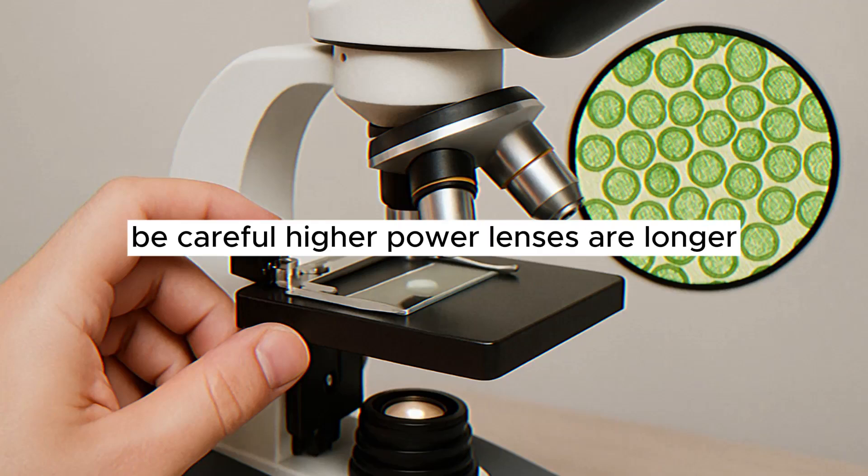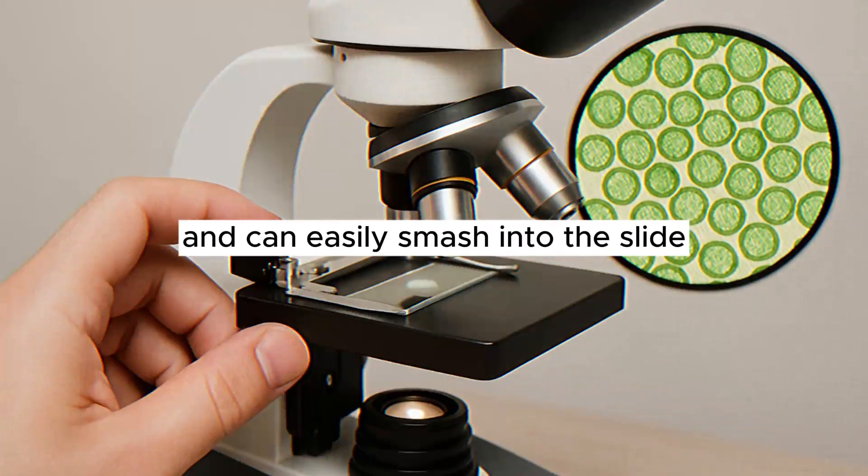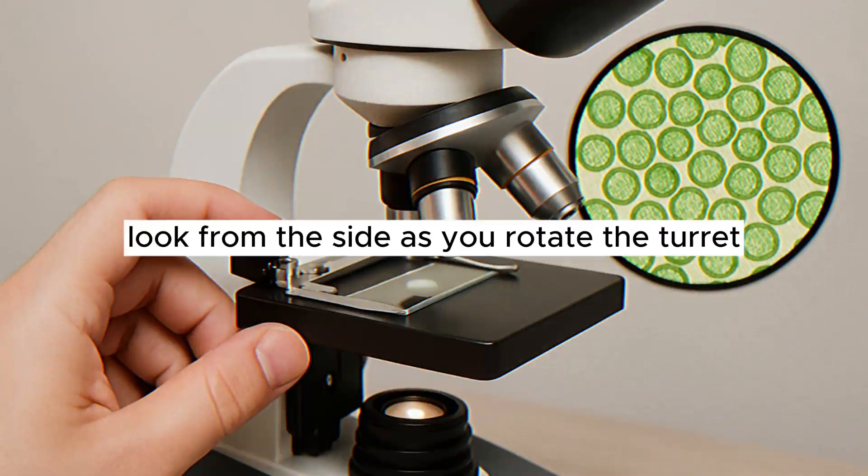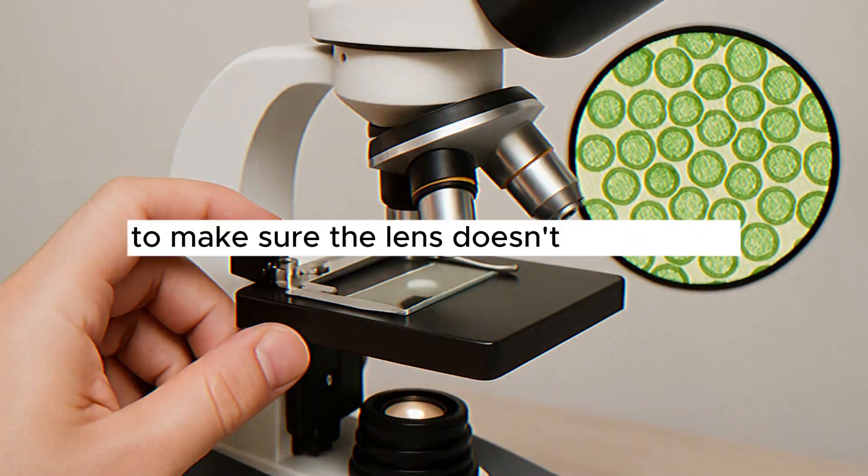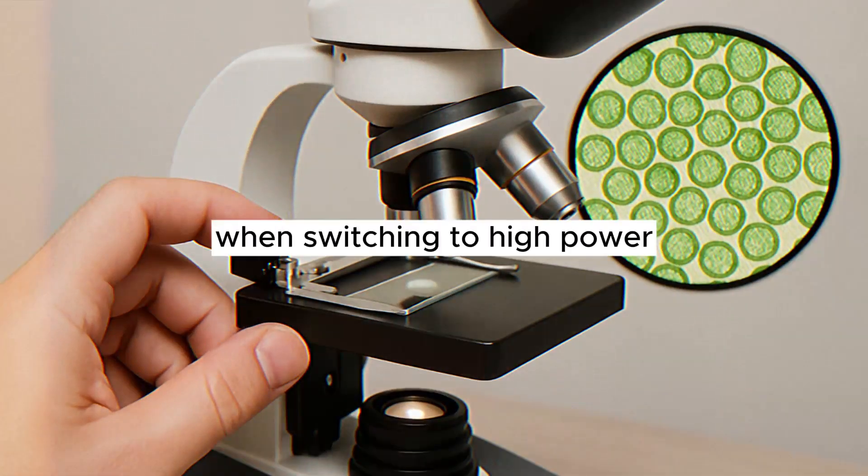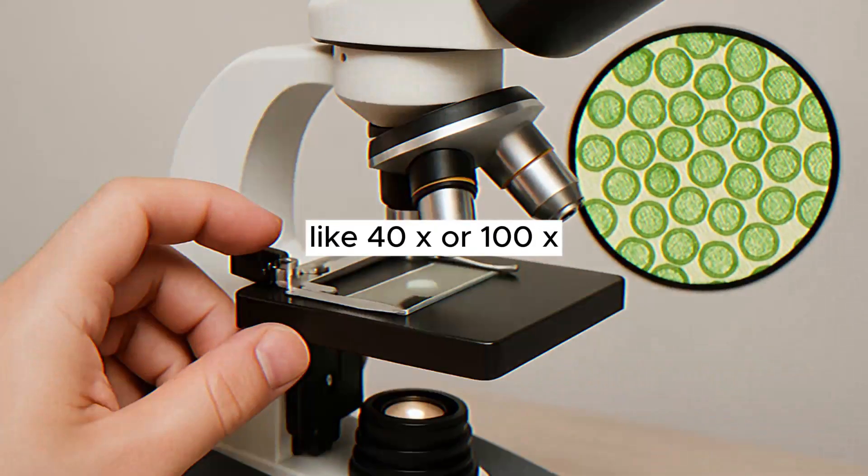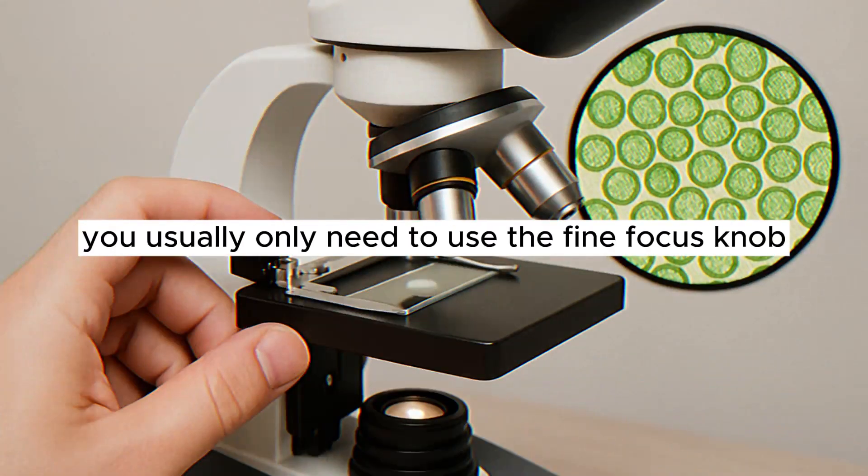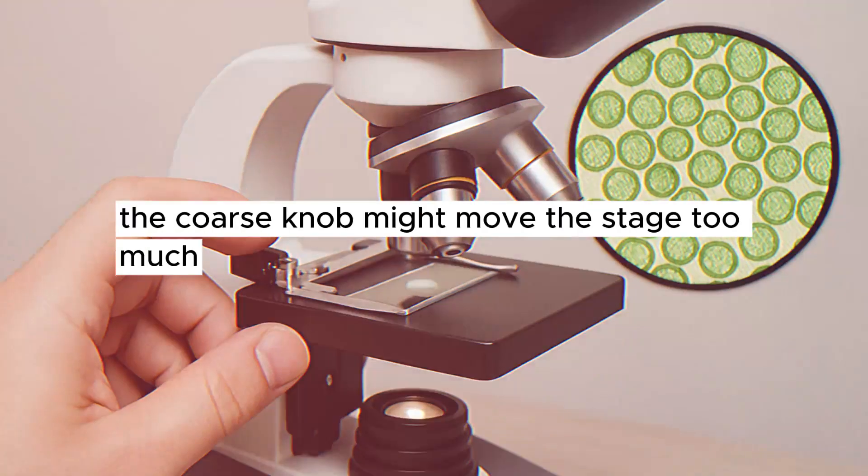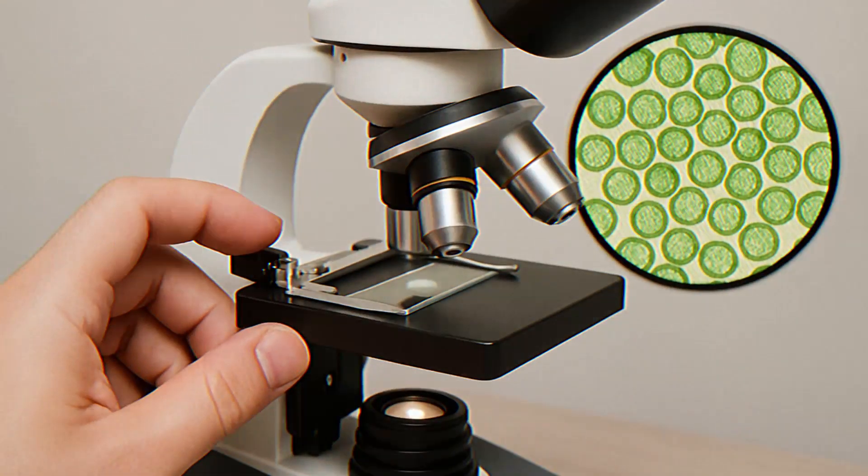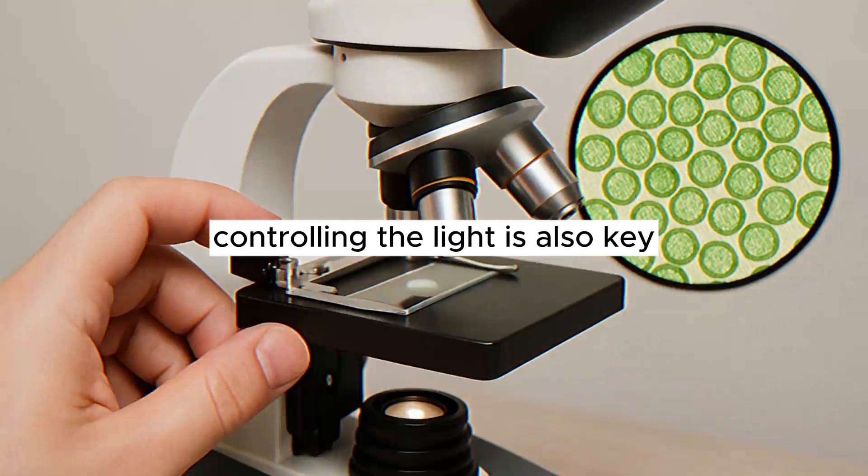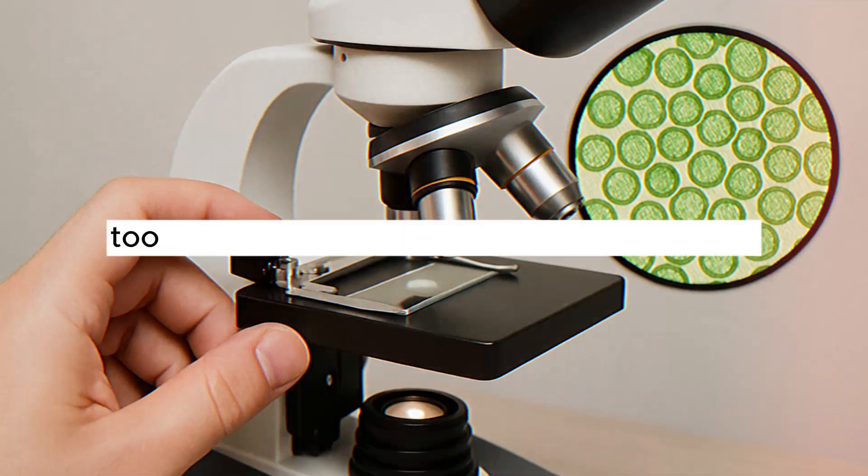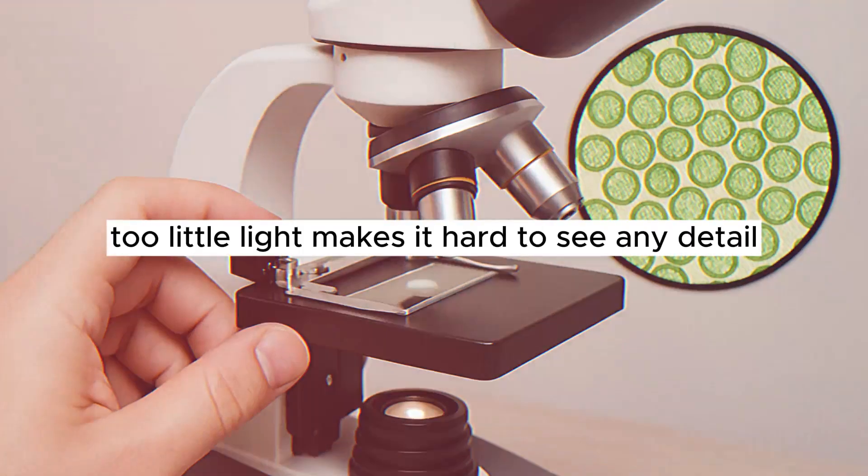Be careful! Higher power lenses are longer and can easily smash into the slide if you're not paying attention. Look from the side as you rotate the turret to make sure the lens doesn't hit the slide. When switching to high power, like 40x or 100x, you usually only need to use the fine focus knob for tiny adjustments. The coarse knob might move the stage too much. Controlling the light is also key. Too much light can wash out a thin specimen, making everything glare white. Too little light makes it hard to see any detail.